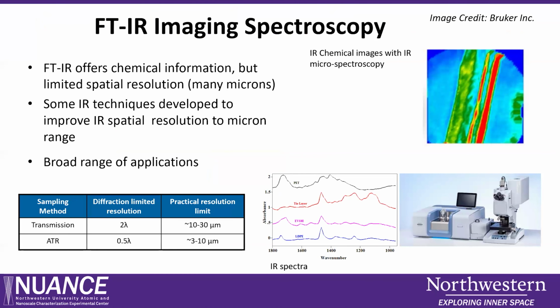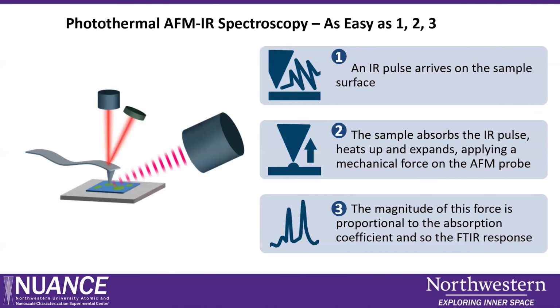I know most of you are using the FTIR in the KEC facility. FTIR spectroscopy also provides pretty good information about the chemistry, but it has limitations on the resolution. That's why nano IR is a very powerful technique.